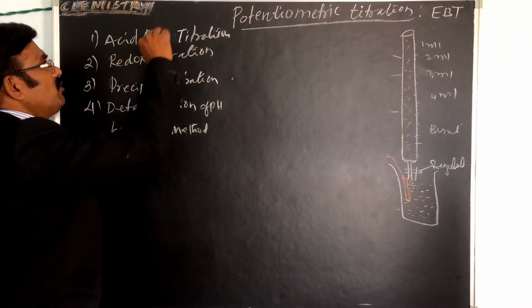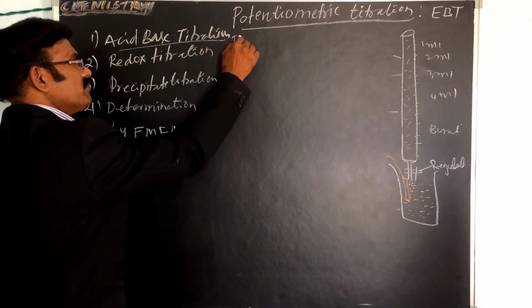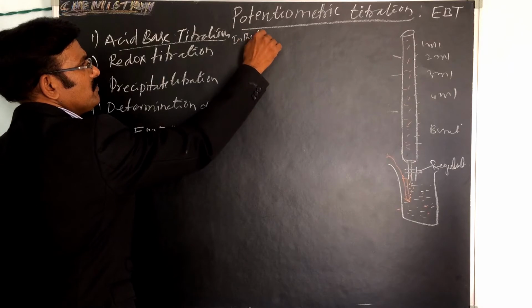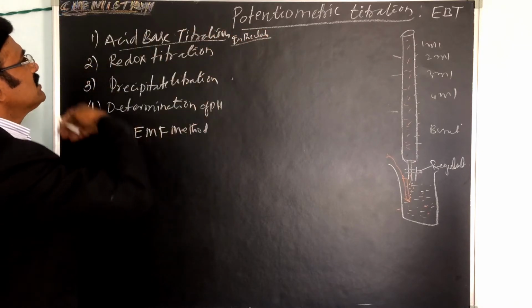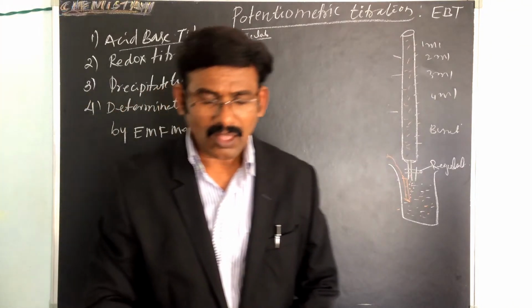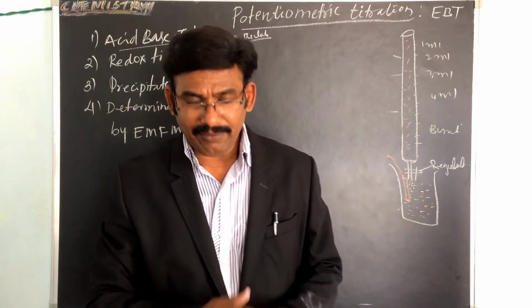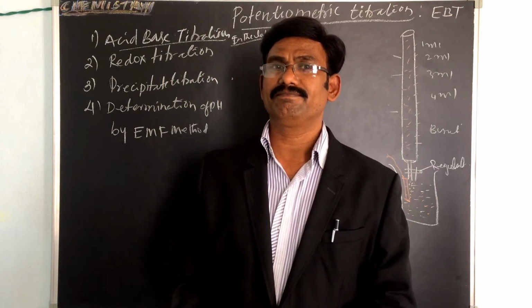In this I will explain the acid-base titration very clearly, because we have it in the lab also, so please listen carefully. Then similarly redox reaction, precipitation, like that, everything follows. Okay, clearly I will explain. First, acid-base titration.